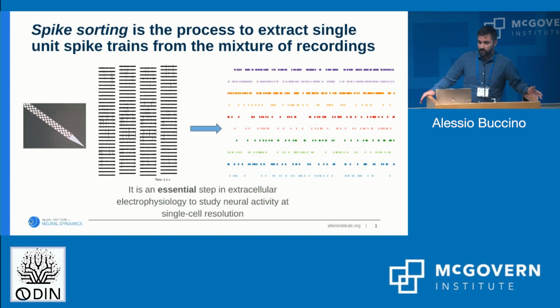So it all starts from here, and I guess from yesterday, you realize that this is not a trivial problem, right? So we have extracellular electrophysiology data. Now with recent newer technologies, we can record neurons at unprecedented yield, right? And an essential step in processing, virtually for all experiments, is extracting single neuron activity from these extracellular traces that contain a mixture of activity from multiple neurons.